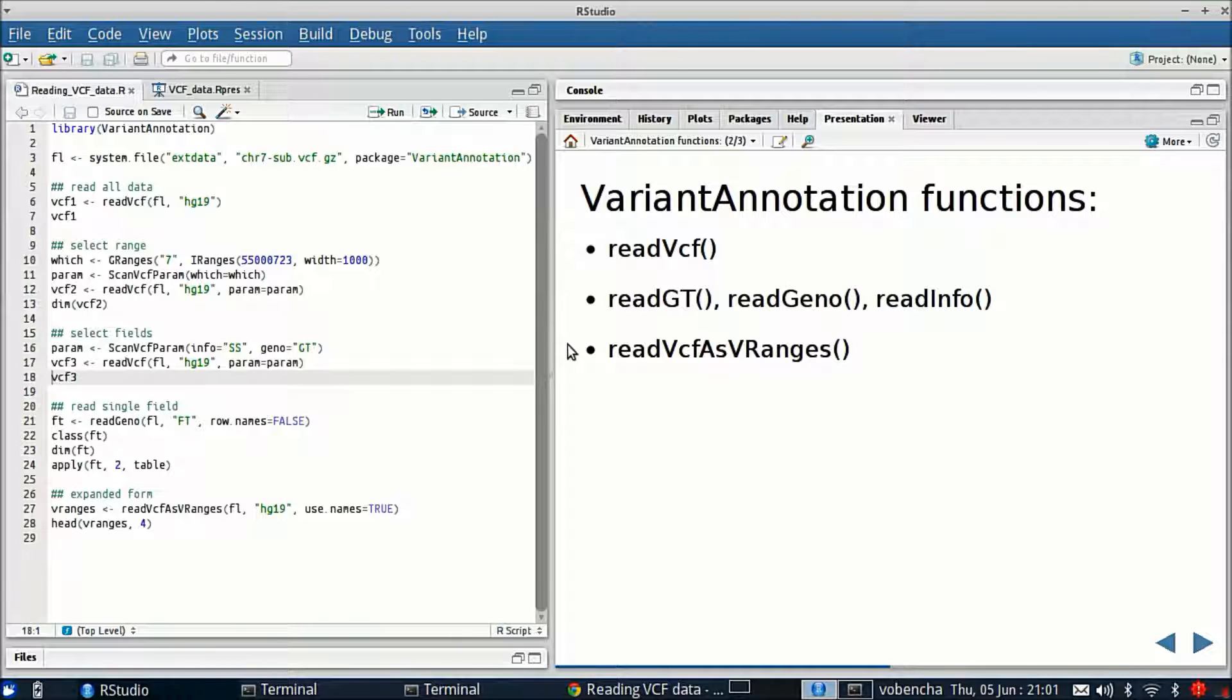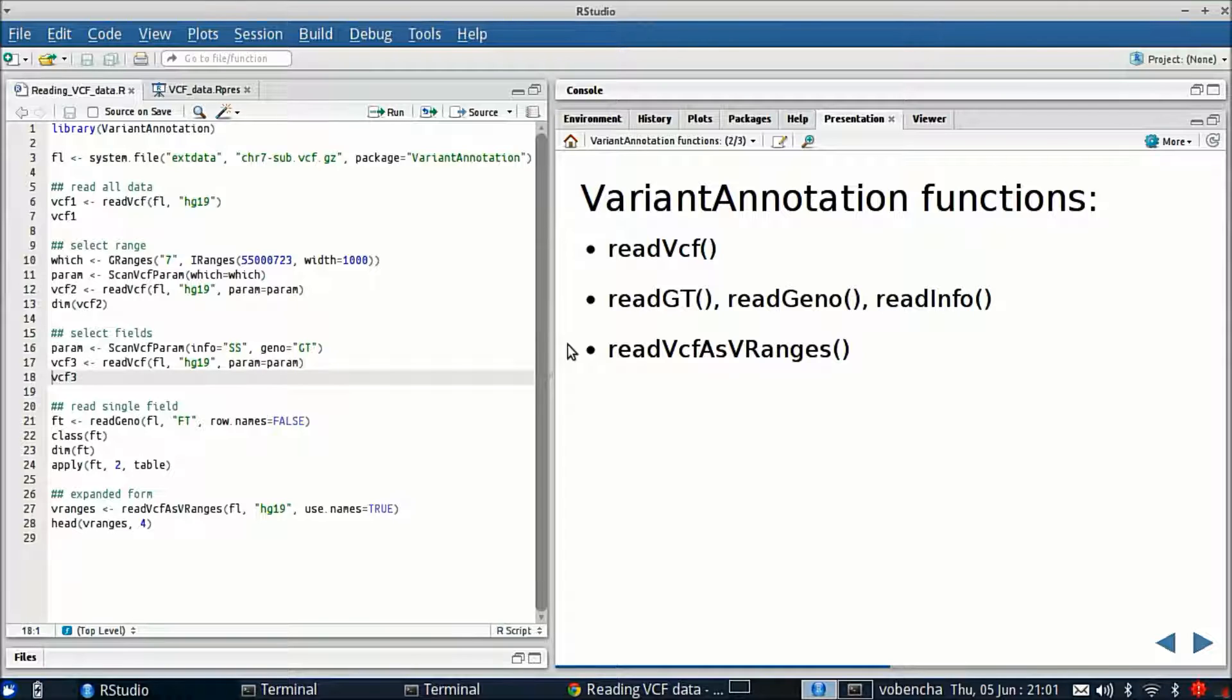The third thing is ReadVCF as VRanges and this function is a flattened form of the data. It reads it into something called the VRanges class which is an extension of GRanges for those familiar with that. It basically expands the data by sample.